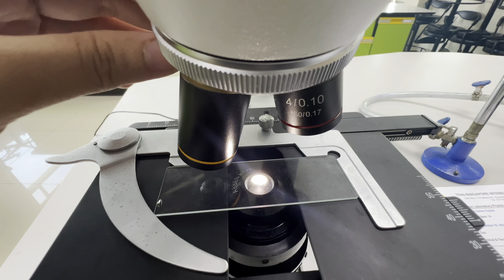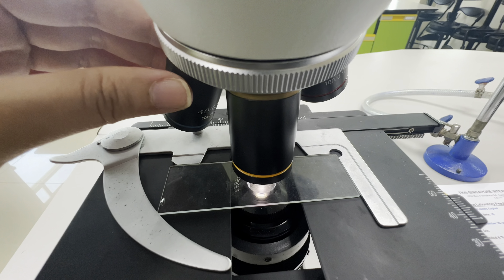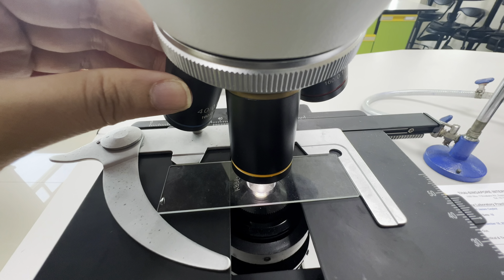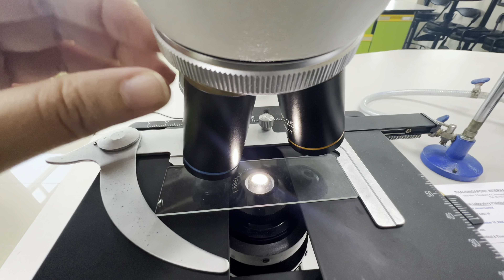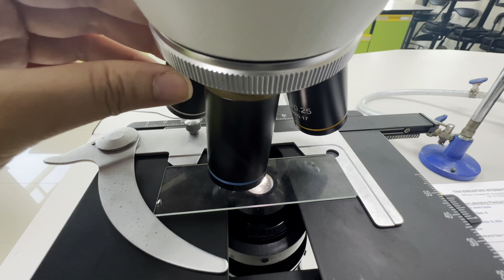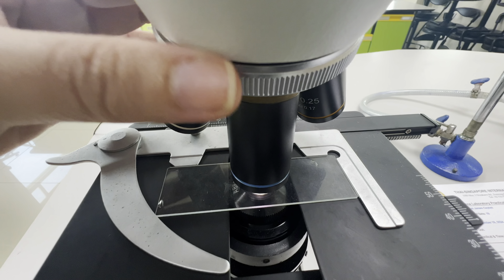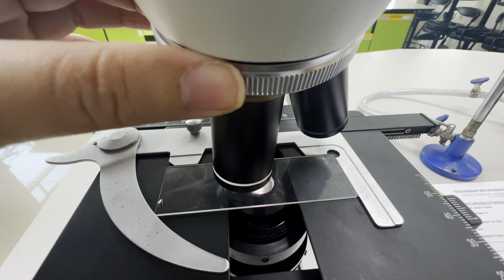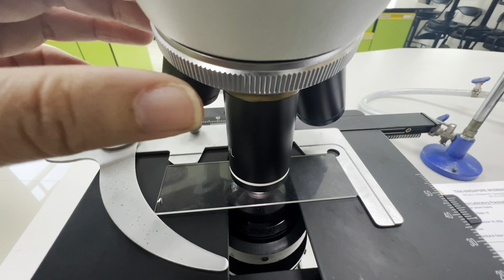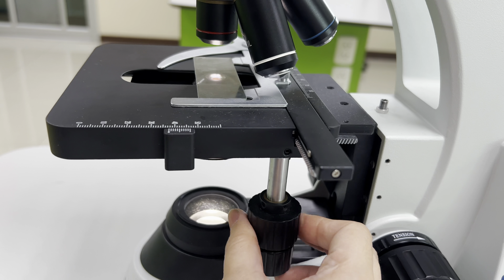These magnifications are multiplied by 10 from your ocular lenses, making the red scanner 4 times 10, now 40 times magnification. The yellow or low power objective is now 100 times magnification. The blue or high power objective is now 400 times magnification. And the white or oil immersion objective is now 1000 times magnification.